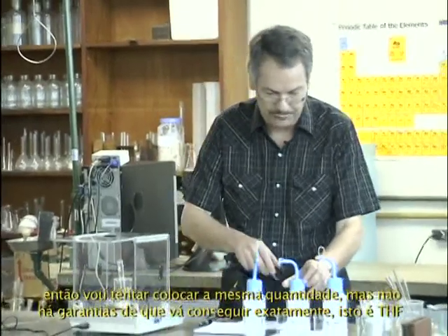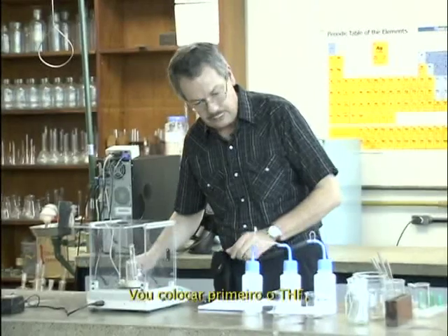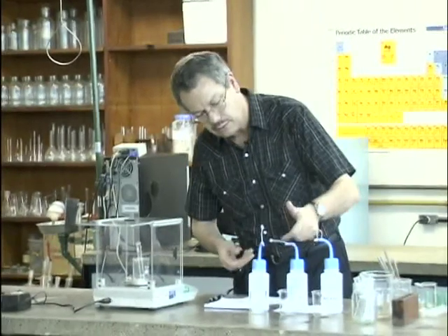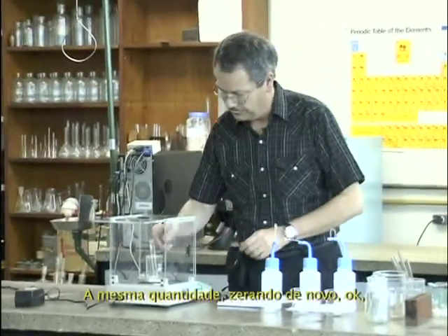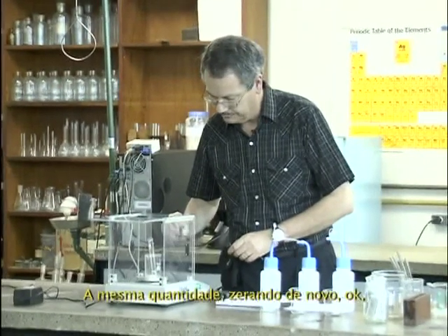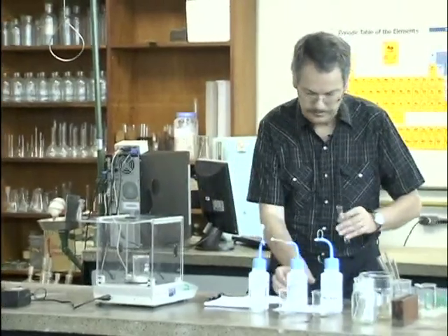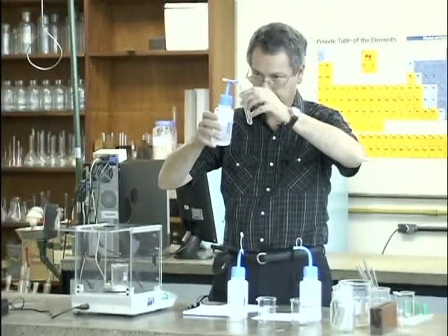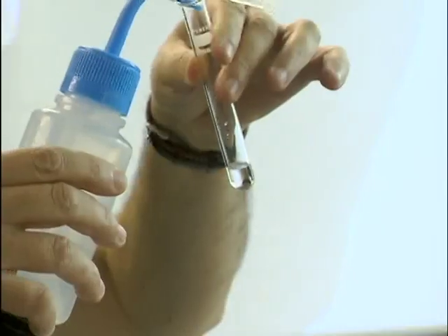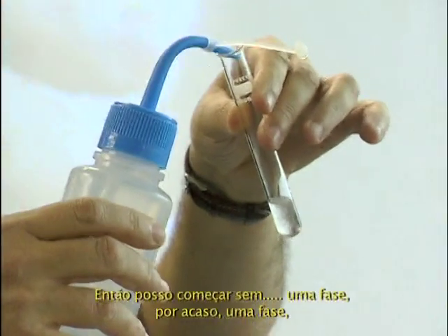So this is THF. I'll put THF first. It's dripping alone. First, the same amount, putting 0 again. Okay. So I can start.